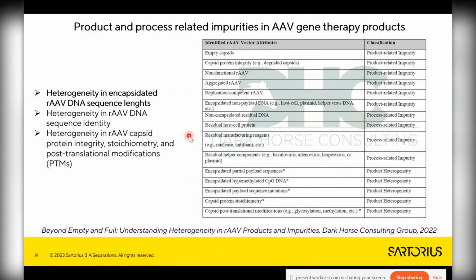Now going further to the analytics. We could see lately that it is more and more important to not only remove the empty capsids, but also the partials or the heavy capsids, those which may carry on to the final products, and fragments of host cell DNAs, and fragments of plasmids, or whatever.